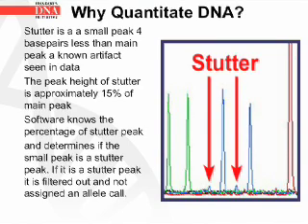From the diagram at the side, you can see where the two stutter peaks — those small peaks in blue — are labeled, and they correspond to their main peaks, which are also in the same blue dye. The peak height of stutter varies, but it is approximately 15% of the main peak. The software knows the percentage of the stutter peak and determines if the small peak is a stutter peak or not. If it is a stutter peak, it is filtered out and not assigned an allele call.